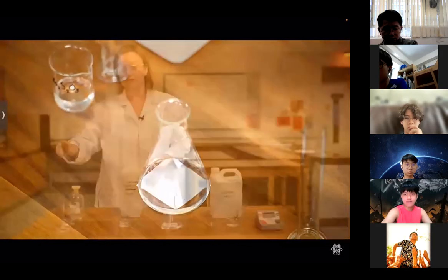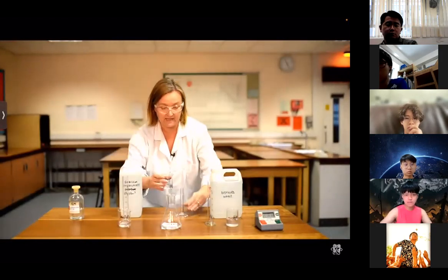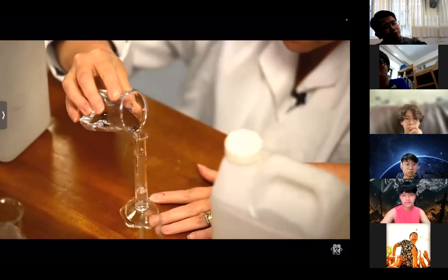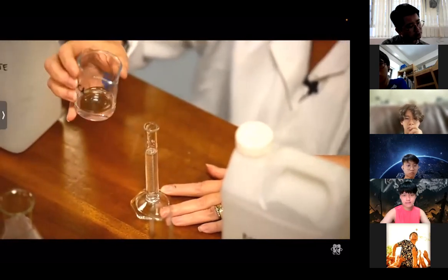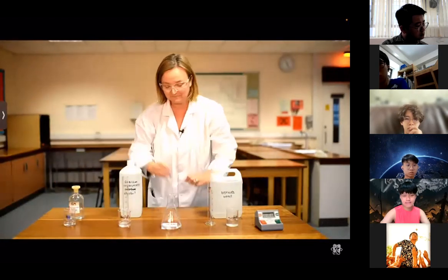I'm now going to measure out just 10 of the acid, so I'm using a slightly smaller measuring cylinder, and again getting down to eye level, holding the measuring cylinder firmly so it doesn't fall over, and measuring out exactly 10 centimetres cubed. You can use a dropping pipette to do that, but I don't.